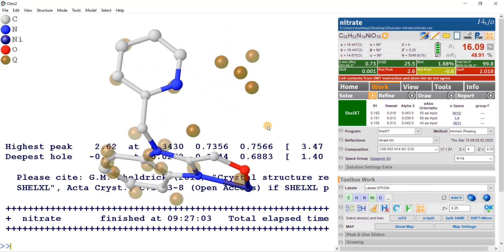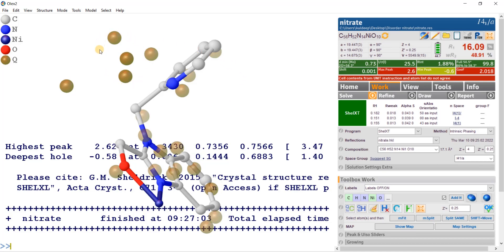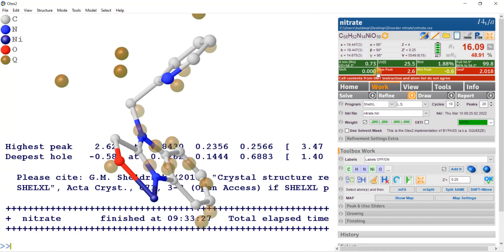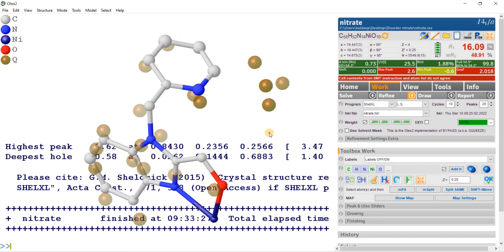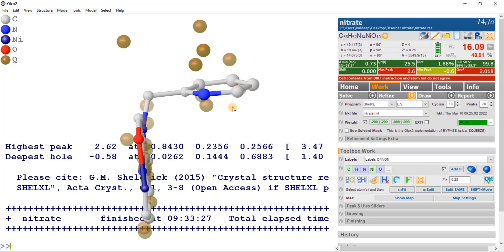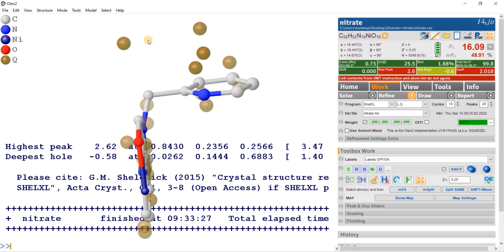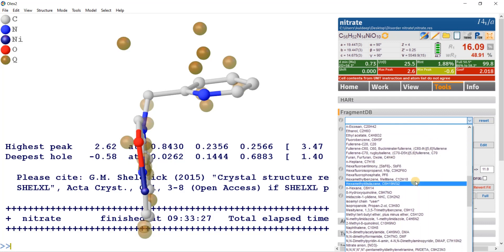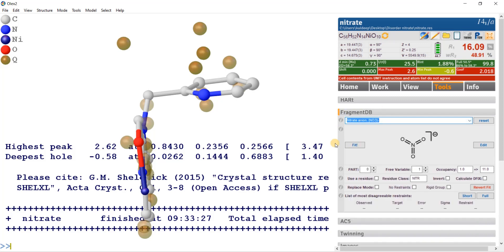As a routine refinement, I am going to model the nitrate and the lattice water molecule. For this I am using the program FragmentDB, but before that let's refine the present structure. Now the shift is zero and the refinement is converged. Compacting the molecule — this is the best view. This seems to be nitrate and this is water. I am going to fit from FragmentDB, searching for the nitrate anion. I will fit at general position with full occupancy: part zero, free variable one — everything is default.